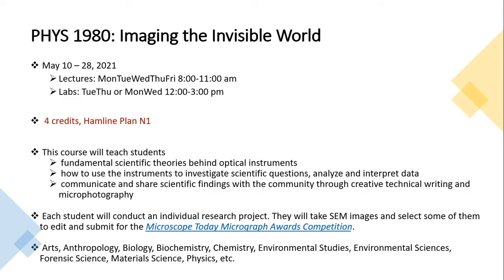This course will teach students fundamental scientific theories behind optical instruments, including the light microscope, scanning electron microscope, transmission electron microscope, and energy dispersive X-ray spectrometer, and how to use the instruments to investigate scientific questions, analyze and interpret data, and communicate and share scientific findings with the community through creative technical writing and microphotography.